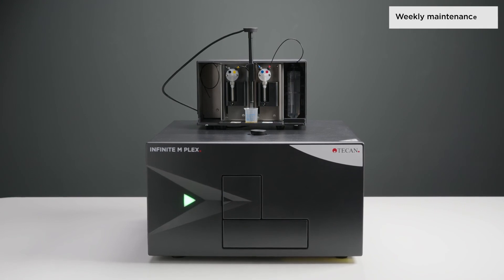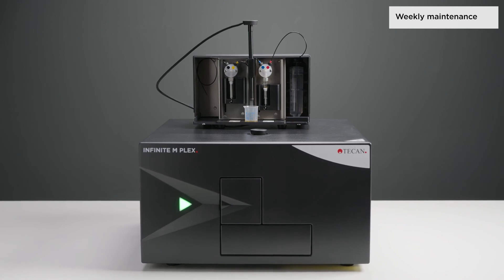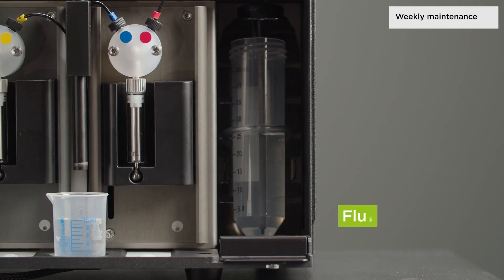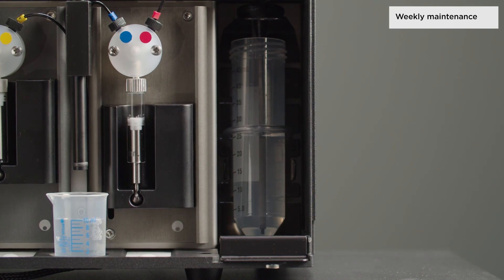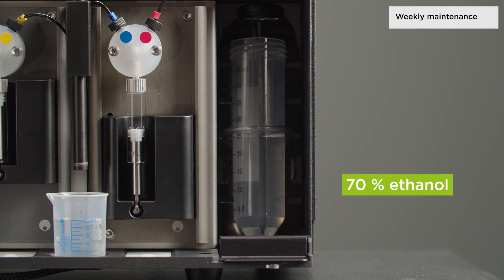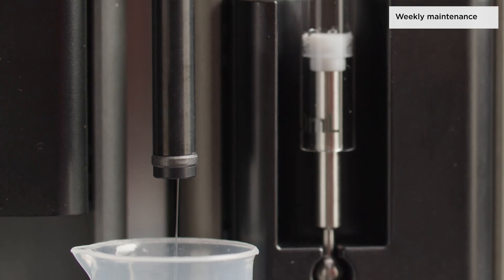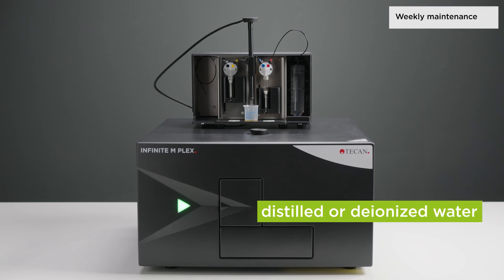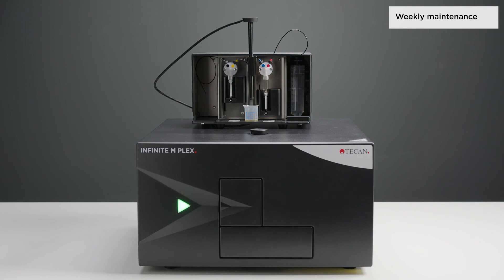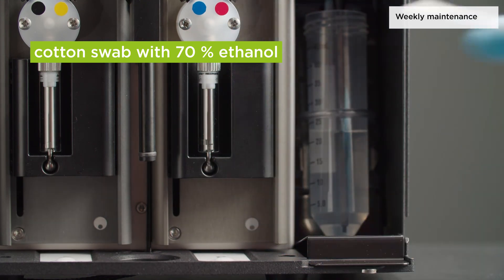The injector system must be cleaned weekly with ethanol to remove precipitates such as salts and eliminate bacterial growth. Thoroughly flush the system with buffer or distilled water, then rinse with ethanol. Rinse the fully lowered syringes with ethanol. Pump all the fluid from the syringe and tube into a waste container. Rinse the injector system with ethanol followed by distilled or deionized water. Leave the fluid pathway filled for storage.